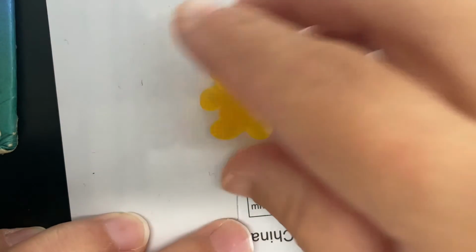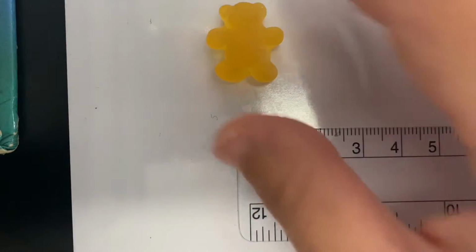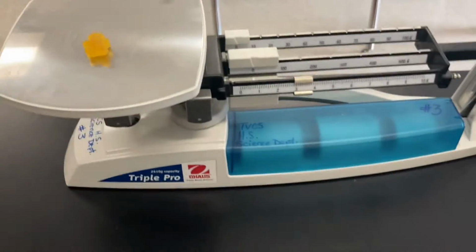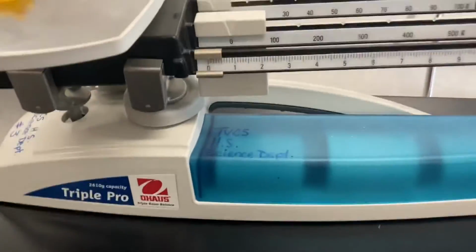Okay. Now the next step is we have to take the mass of the gummy bear. We're going to use a triple beam balance to do that. So I'm going to take this gummy bear and set it down on the balance. There we go.